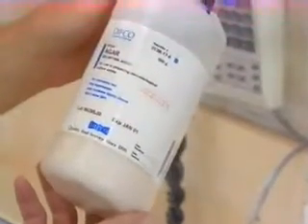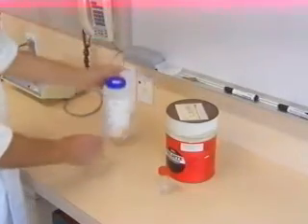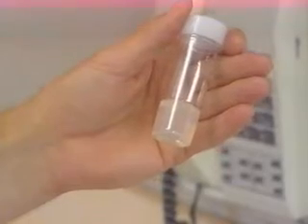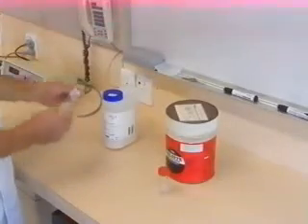There are various gelling agents that can be used. For example, agar, which is extracted from the cell walls of a number of red algae, produces an opaque gel and, generally speaking, is dissolved on a hot plate with a magnetic stirrer for continuous stirring of the agar.